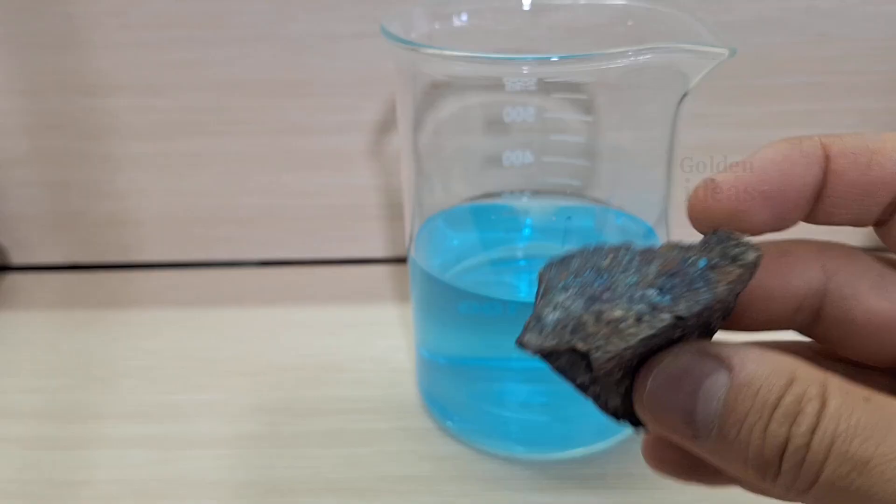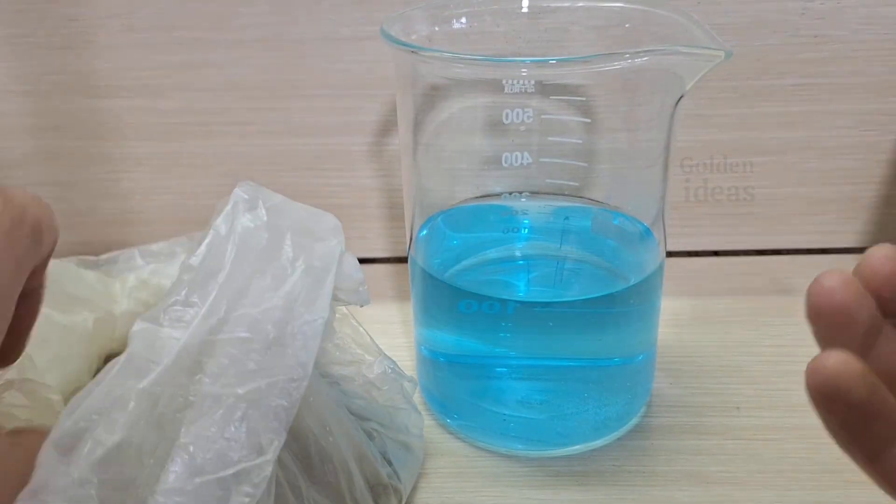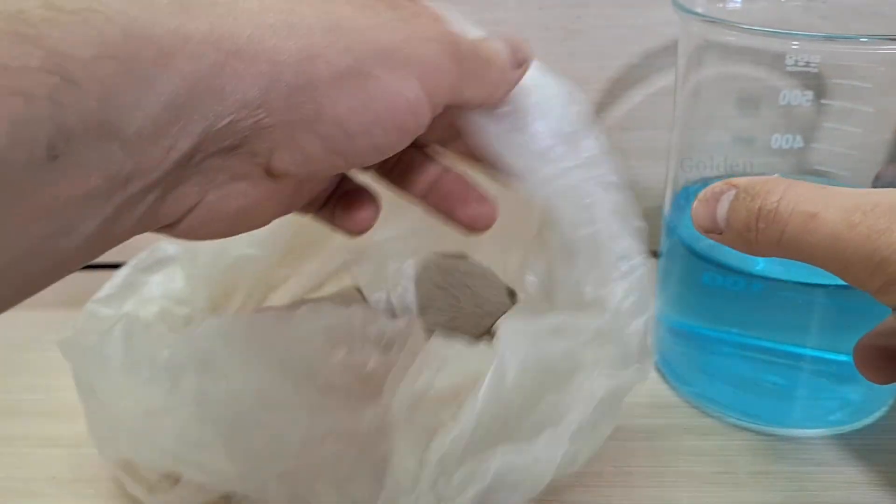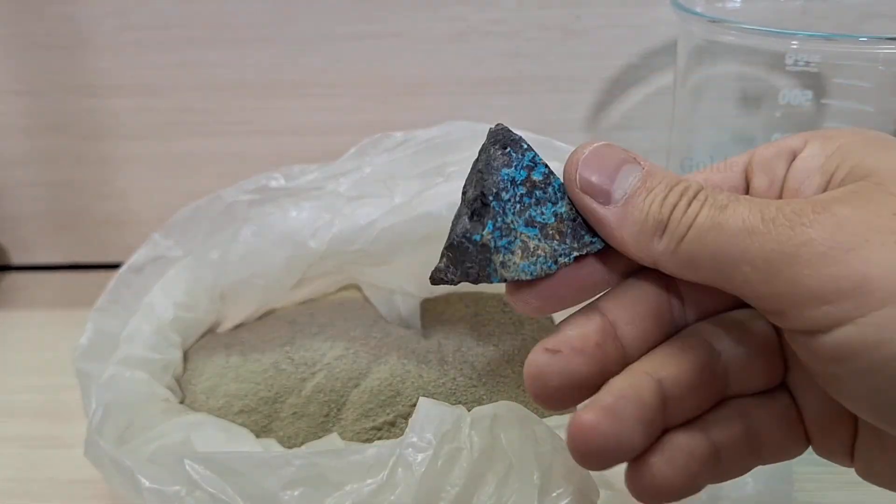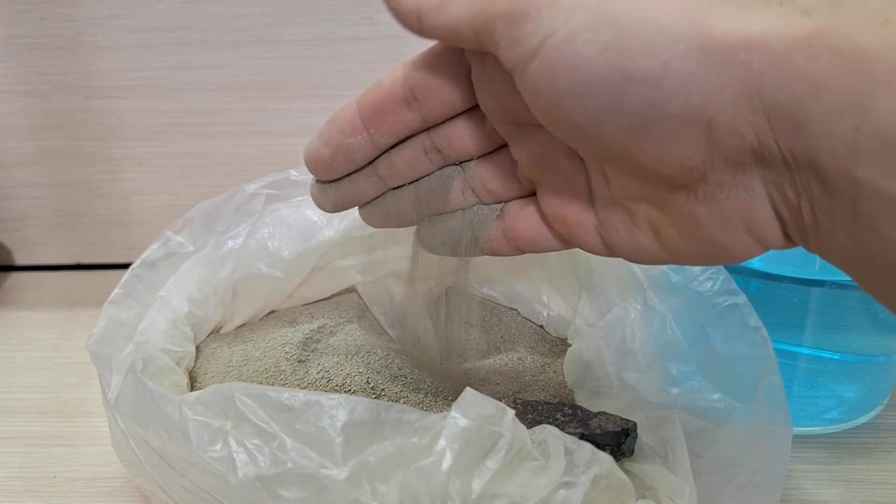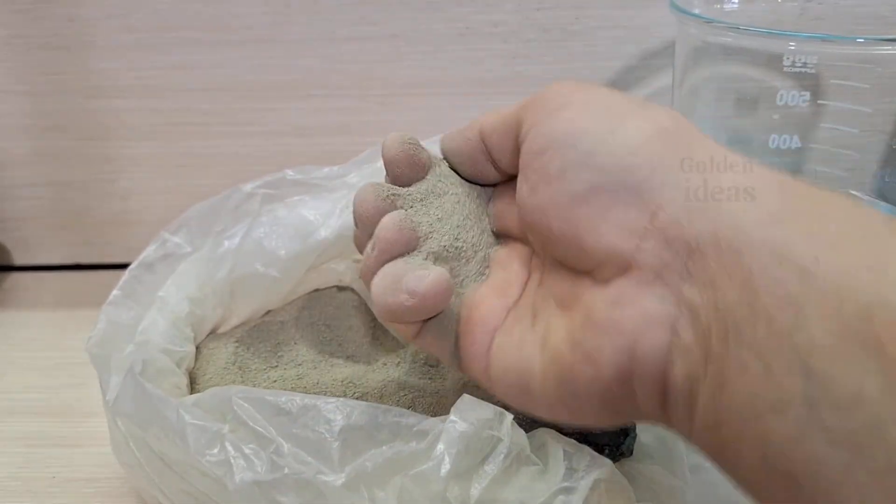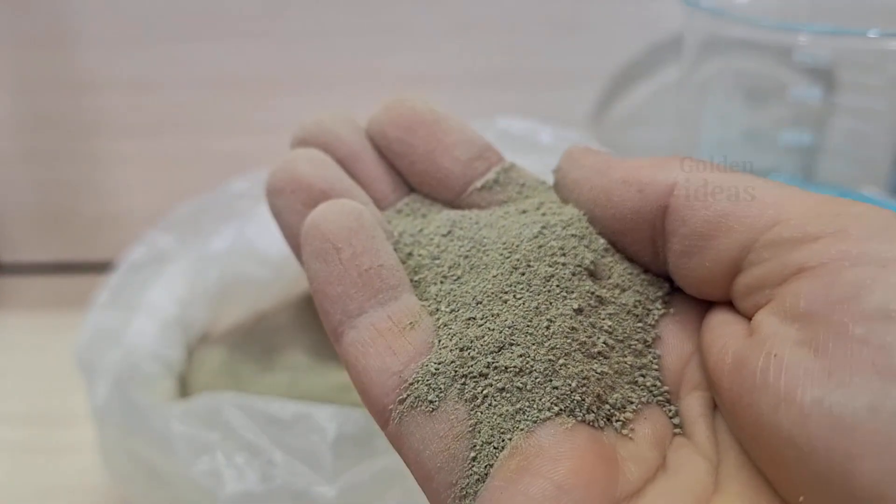This rock that you see in my hand contains small amounts of gold, silver, and copper. I'll show you an approximate percentage of each element on the screen. I've already ground a portion of this rock down to 200 mesh powder. The finer you grind the rock, the more surface area it provides for reactions with acid or cyanide.